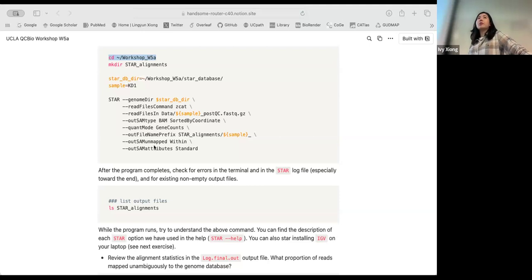Okay, so we're all waiting for alignment, I guess. It says that it ran. Great. But I don't know, that was too quick, right? It ran in a couple of seconds. I don't know if it's finished or still running. It's finished successfully. I see. Then that's great. Wow. Yeah, it took me a while. Maybe the core I got was just very slow.